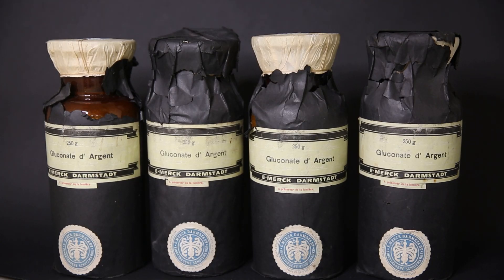For this video, I found some old pharmacy bottles online which contained silver gluconate, a silver salt with gluconic acid. Relative to the silver content, they were pretty cheap, and therefore I wanted to try to get the silver out of them and see if it is possible to make a profit.